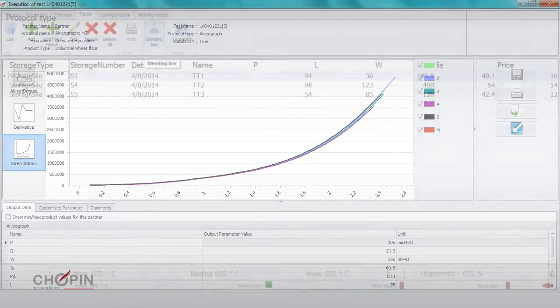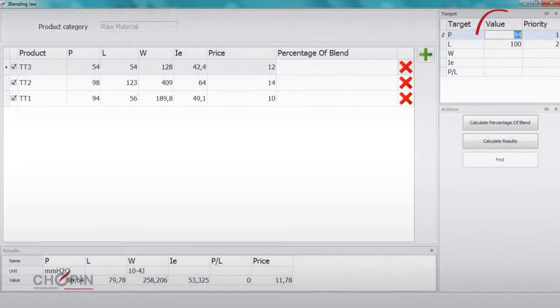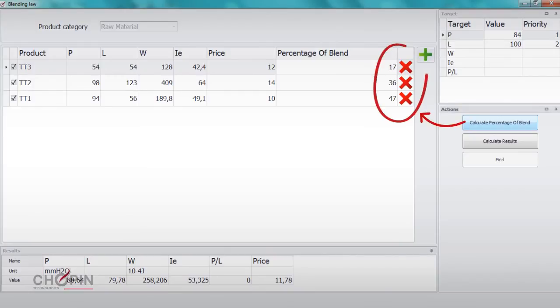A new feature for optimizing wheat and flour blends has also been introduced. Finally, the improvers guide helps the user to choose the most suitable additive to reach specific target alveograph values.